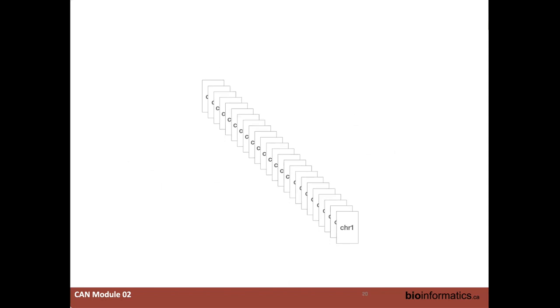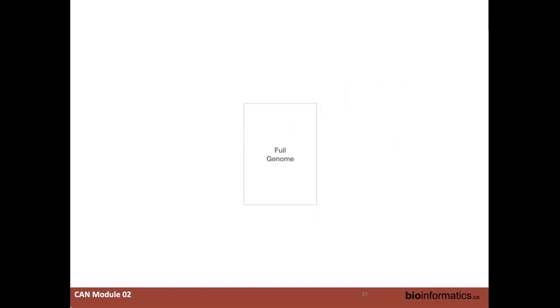One thing though is that working with a whole bunch of files kind of sucks. So a lot of the time we'll merge them and want to deal with only one full genome. This brings us to the next topic, the FASTA file itself. You don't actually just have to save one sequence in there. You can take one file and retain the entire human reference in there if you so choose. You could do the same for whoever's working with xenograft data. You can take the mouse reference genome and stick it in there. If you're doing an analysis that requires both human and mouse, you can merge both together in one genome. Keep in mind there are some similarities between those sequences in small batches, but that is a possibility. So you can merge as many of these individual FASTA files as you want.